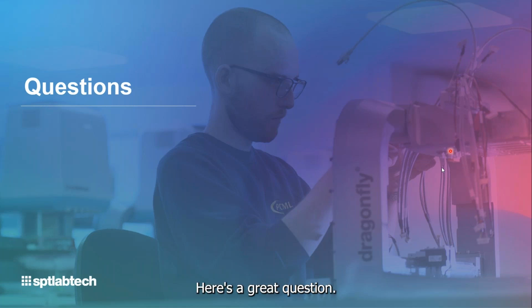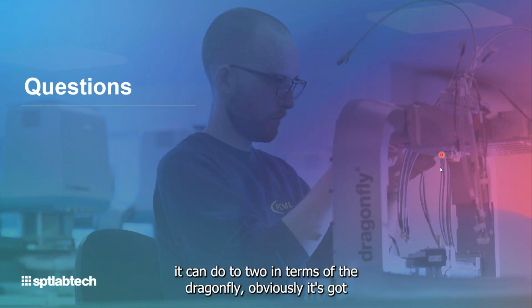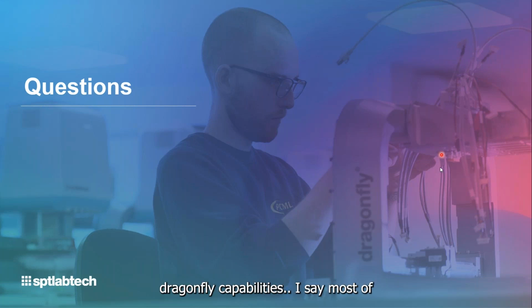Here's a great question. Does the Firefly replace the Mosquito and Dragonfly? I'll take that one as well. No. In terms of the Dragonfly, it has most of the Dragonfly capability.